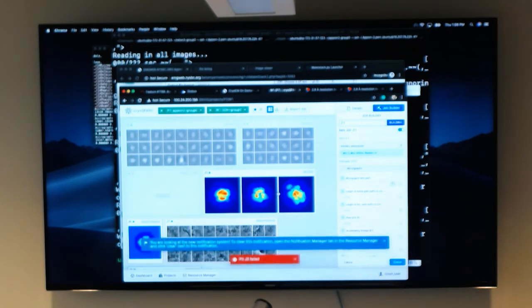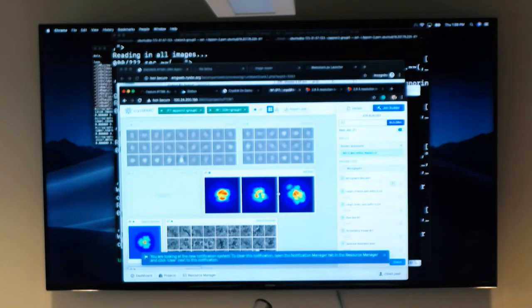It can't handle symmetry. It doesn't even take C3. C1 it is for you. But if you're working with big particles, you have to apply symmetry. Yeah, or if you want to make sure... we should move it much faster.